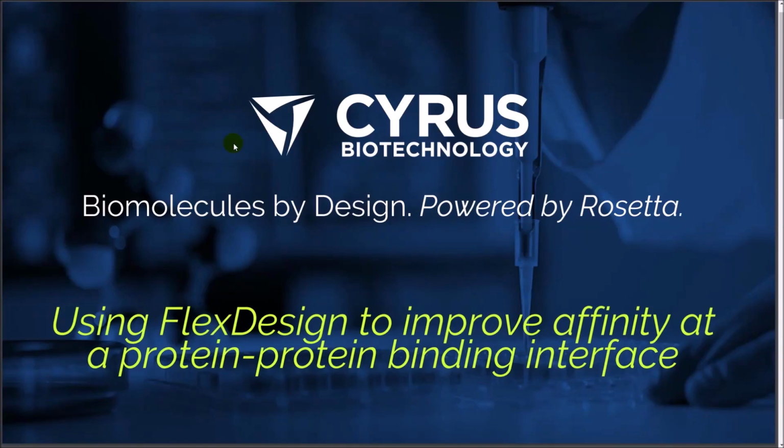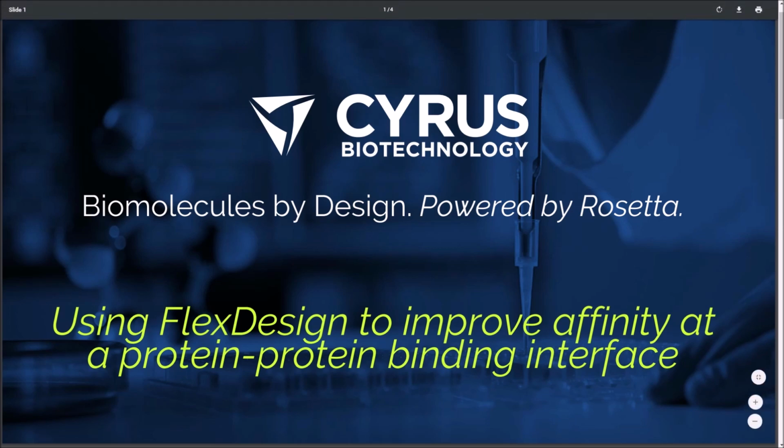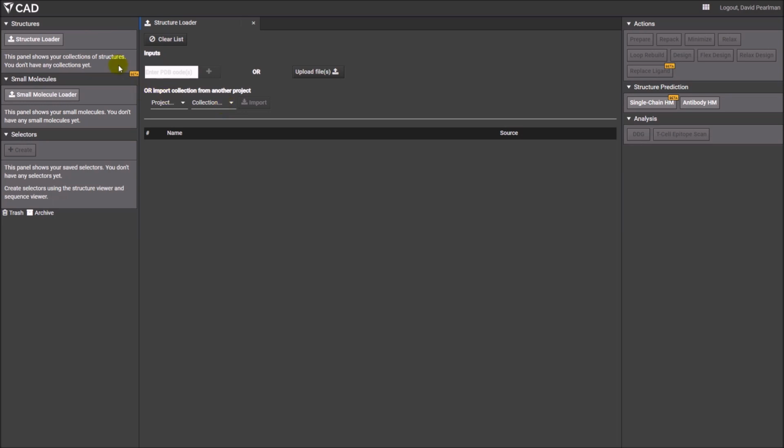Bench has a wide variety of features, but we want to get you started with the simple one, the tool to improve the binding interface between two proteins. This is one of our most popular tools, and it improves interfaces far better than any other software tool. So what you see here is the Bench platform when you open it.